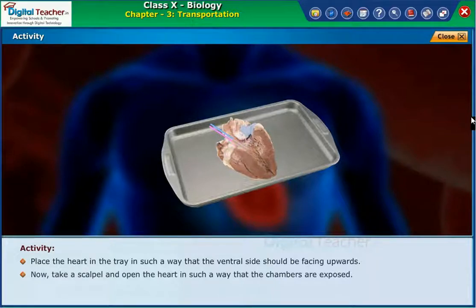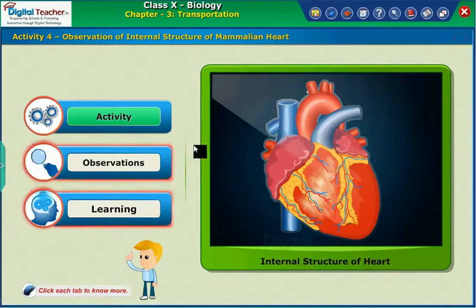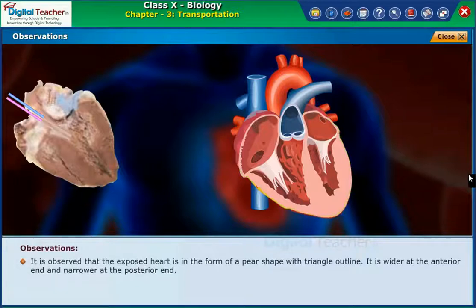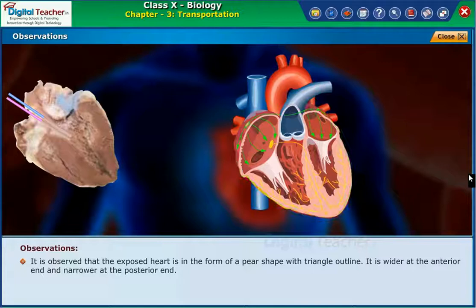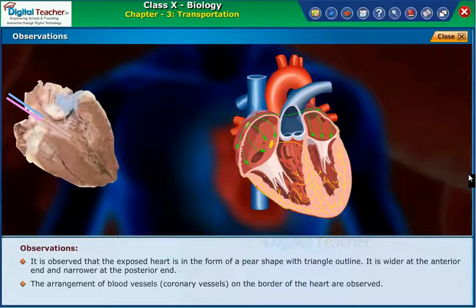Place the heart in the tray with the ventral side facing upwards. Now take a scalpel and open the heart such that the chambers are exposed. It is observed that the exposed heart is in the form of a pear shape with a triangular outline. It is wider at the anterior end and narrower at the posterior end.